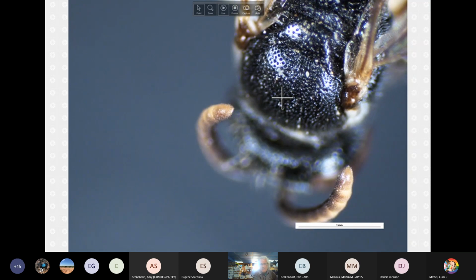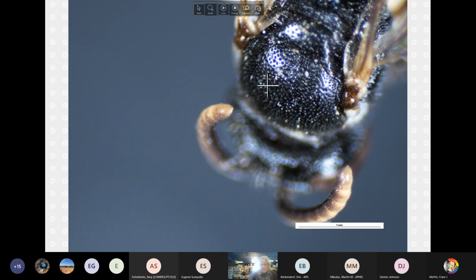Here you can see that the pitting is relatively well spaced. A lot of these pits don't even touch one another. And there's the sort of usual background of tessellations and such. I don't see a parapsidal line. This is probably a parapsidal line, but relatively small pits.